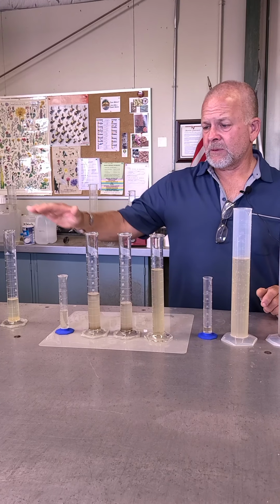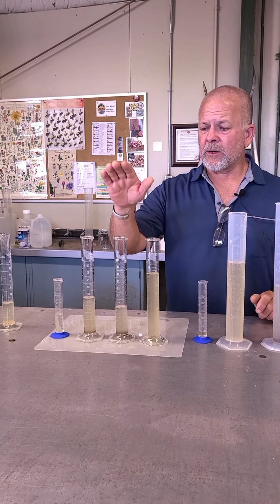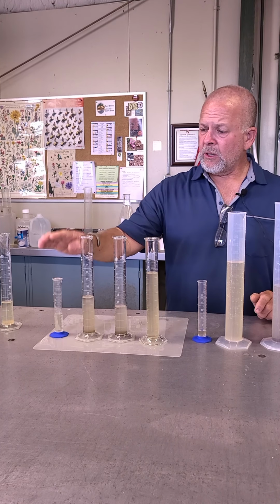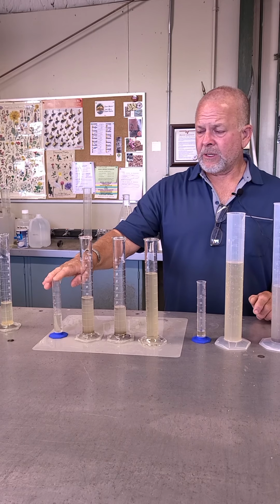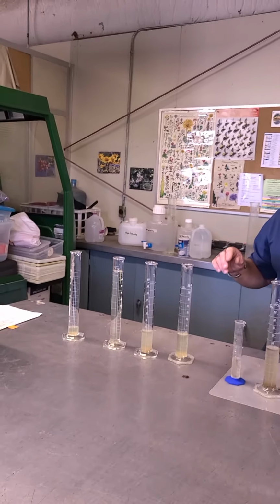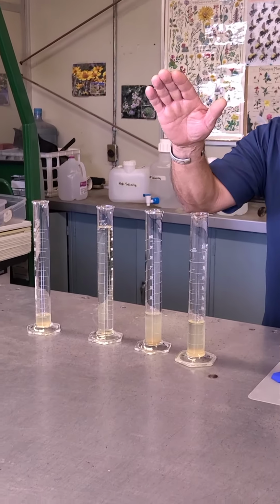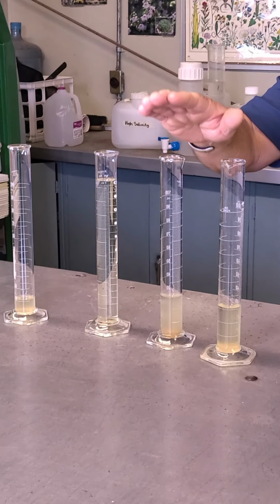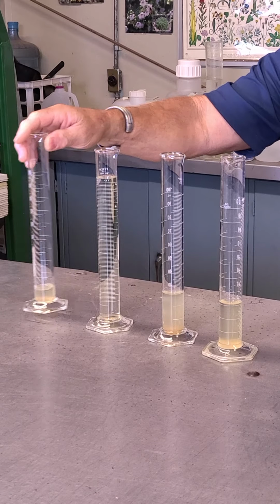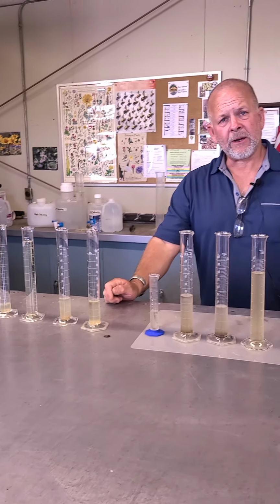So that's the loam. Here we have over here, we have the same treatments in the same order with the loamy sand. I've got the DI water, and I've got the saline soil, I've got the sodic soil, and then I've got the saline sodic over here. And then finally the silty clay loam, you can see we've got the DI water here, saline here, sodic here, and then the saline sodic on that one. So that actually gives you a pretty good representation of how things work.